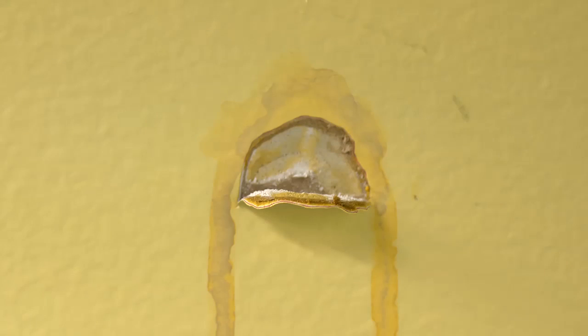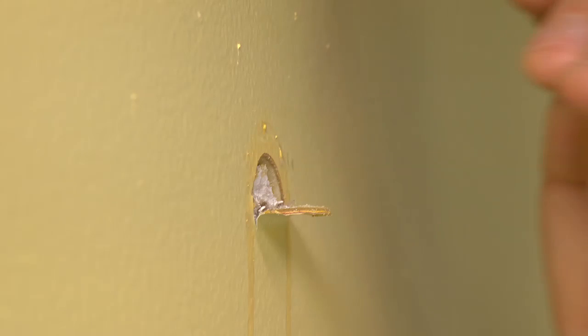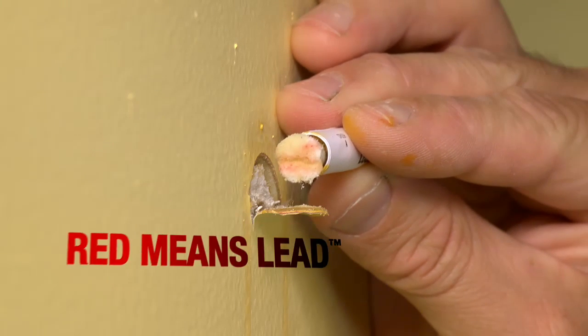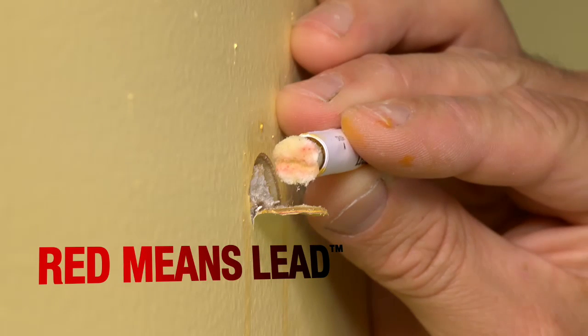If lead is present, a pink or red color will develop along the edges of the cut, flap, or swab tip, usually within 30 seconds. Red means lead.